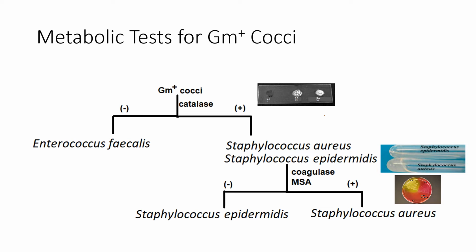What tests often lead us to is more tests. So this is where we are, and I just really want to make sure that we understand that just because it's yes or no to a specific test, you can't make huge conclusions, okay?